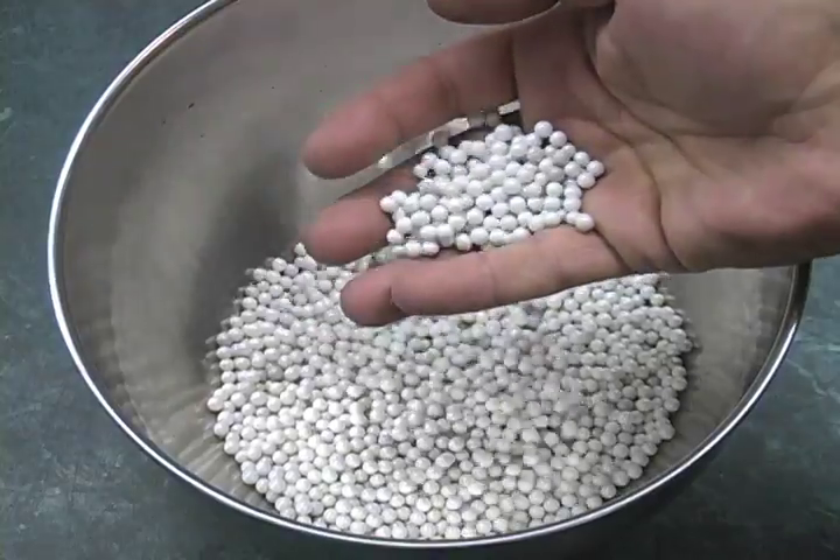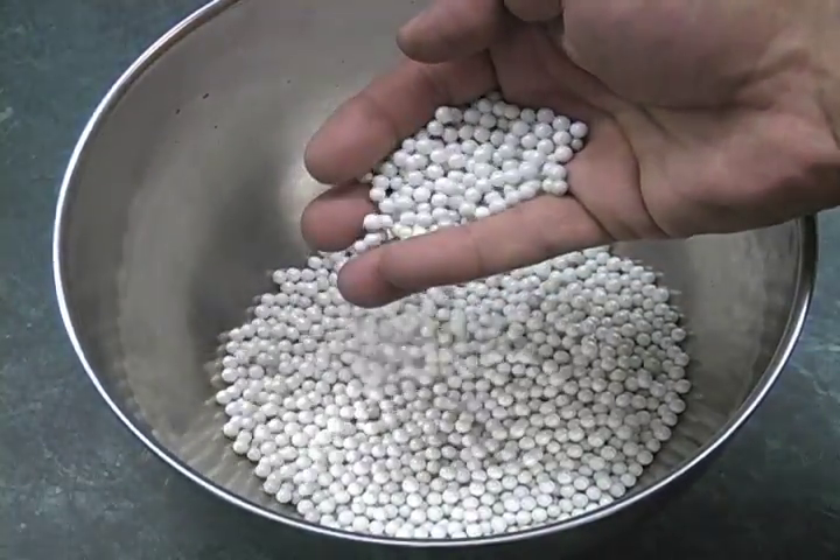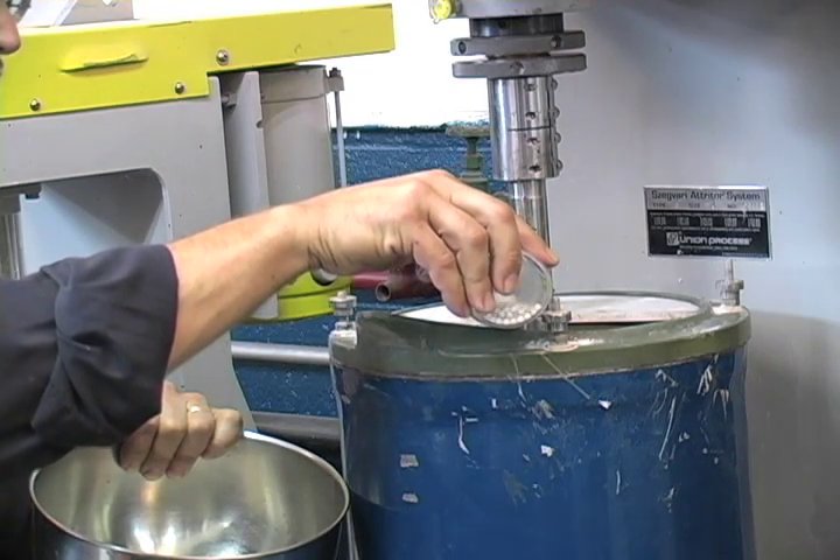Grinding media is selected based on material compatibility and milling requirements. The grinding media is then slowly poured into the Attritor's grinding tank.